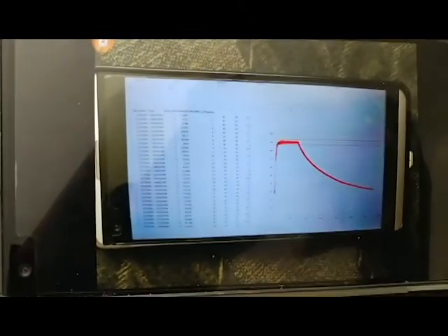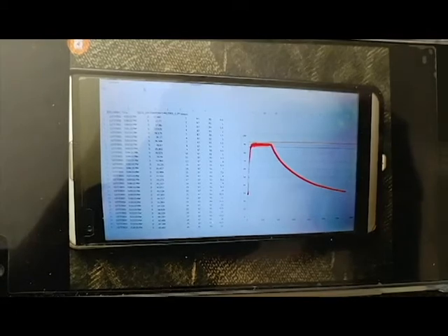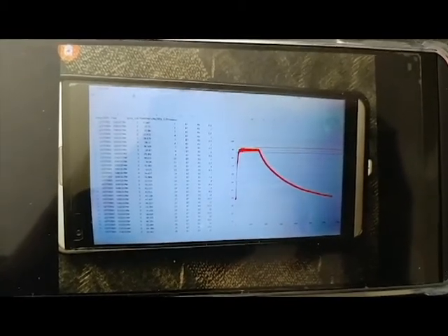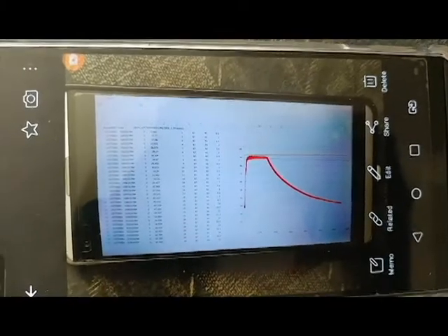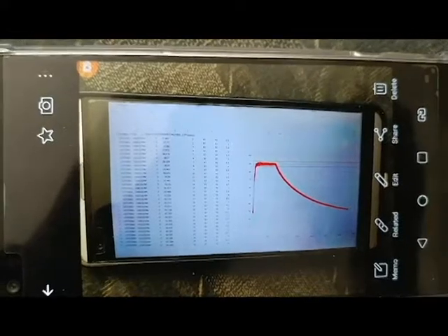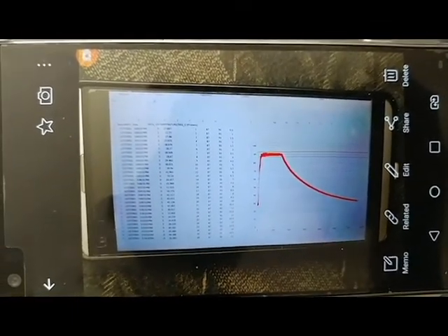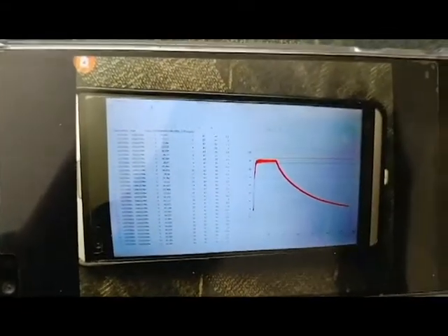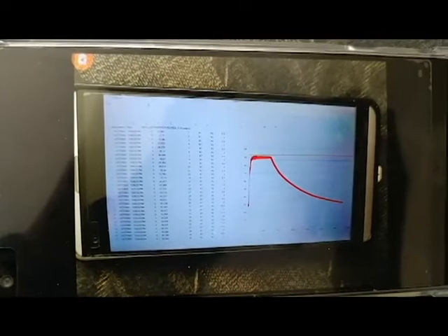The difficulty I face, maybe other people don't have this problem, but for this vacuum oven, when we set at 90 degrees, the temperature will keep climbing, overshooting to 110 before settling down, and it takes a long time. My guess is the way the vacuum oven was designed, since it's a vacuum, there's no air circulation inside the oven, so the temperature rise and fall is very slow. So by the time it reaches set point, the heating filament is very hot and there's a lot of residual heat in the wall of the chamber and other areas, so the heat keeps moving in and the temperature keeps rising.